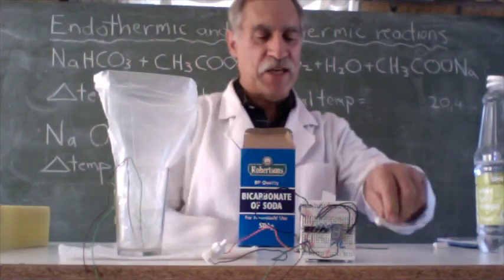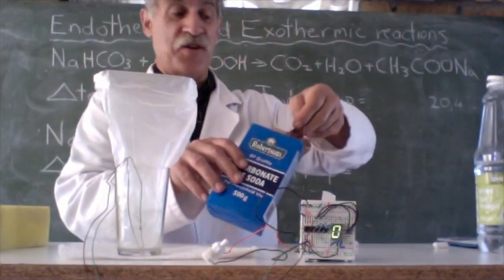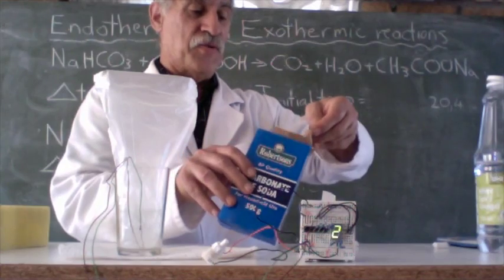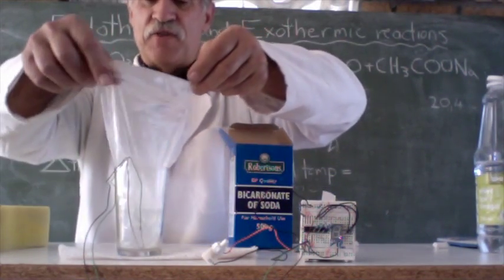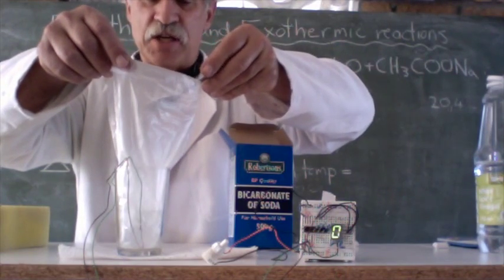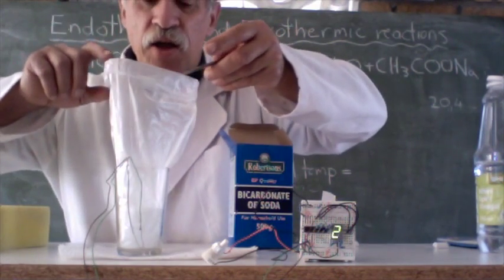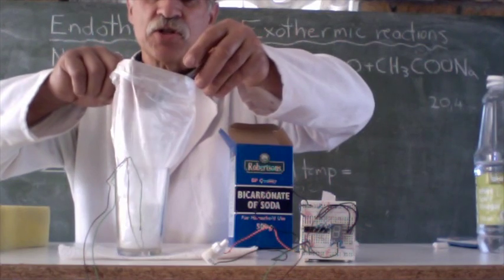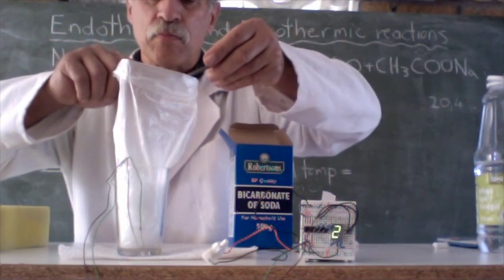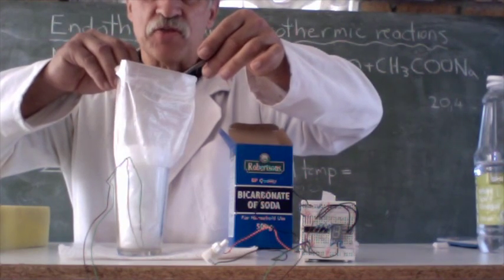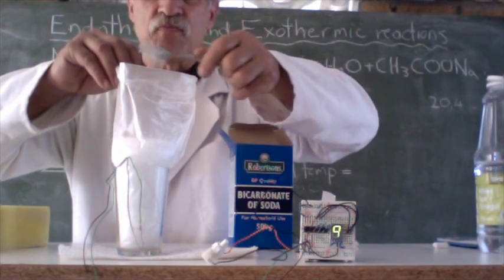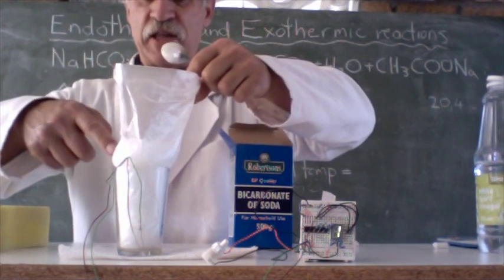Now we're going to carefully add some bicarb and see if the temperature decreases or increases. So it's going to foam. Let's throw in just a little bit of bicarb at first. So it foams up. You can see it's foaming right into the bag.